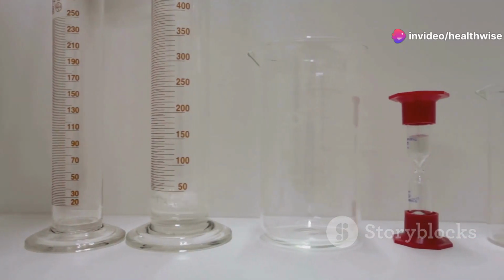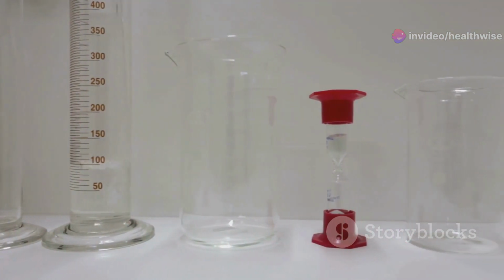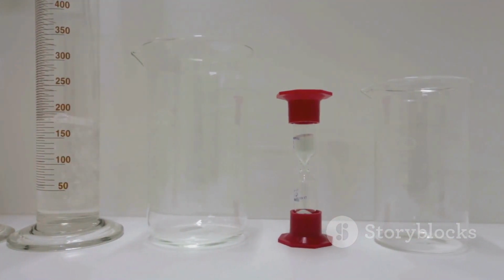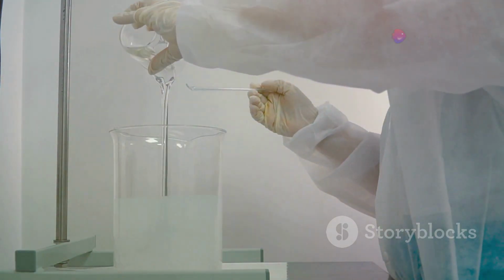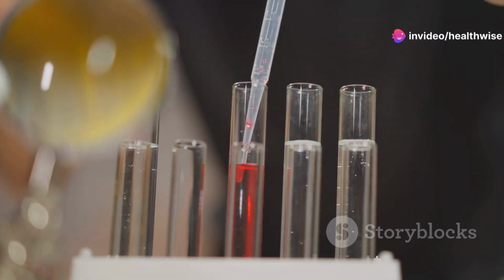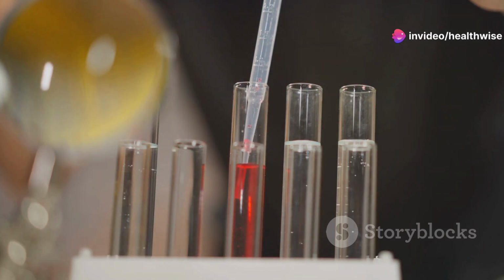Alternatively, you can calculate the factor for each analyte by dividing the known concentration of the standard by its absorbance. Factor F equals the concentration of the standard divided by its absorbance. You can then find the unknown concentration by multiplying this factor with the absorbance of the unknown sample.